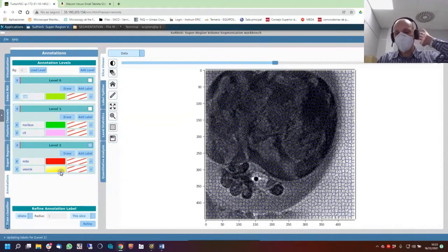If it's just a matter of needing one volume to make an artwork, then it doesn't make sense to keep this as you want. The thing you need to know is whether this voxel will belong to the mitochondria only, or to the cytoplasm and cell.